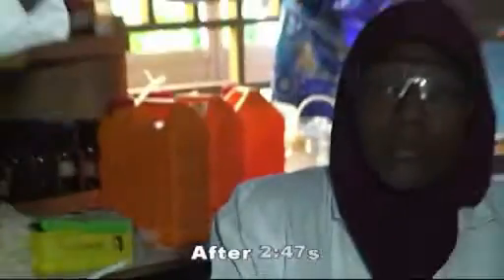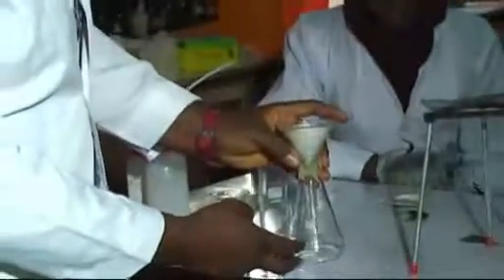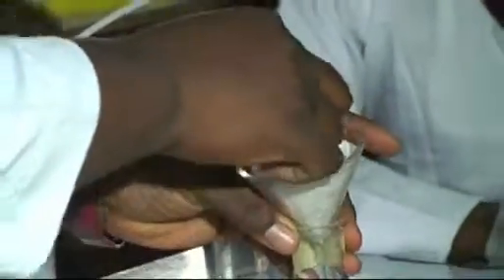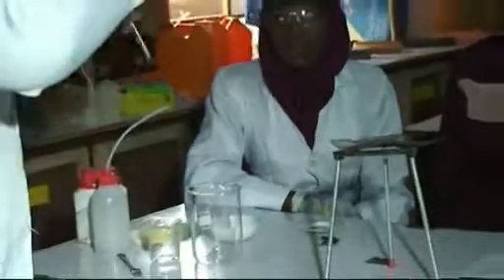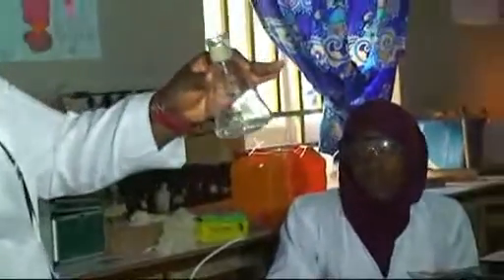After some minutes, we have now filtered our mixture. In here is the filtrate, which contains the water and the salt. And on the filter paper, we have our sand in it. We can as well spread it to allow the sand dry off. But we still want to recover our salt. We want to recover our salt back from this water.